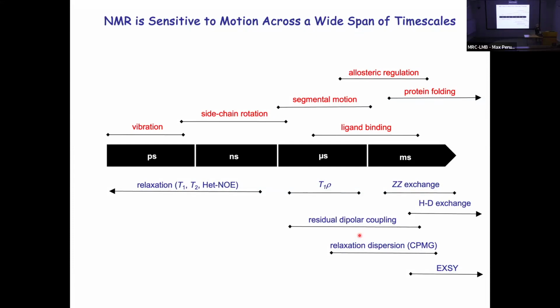talk in more detail about some of the examples that you get in real case studies from LMB's portfolio. This is a slide I've nicked from Jane, and it's just illustrating the sort of approaches that we can apply to NMR experiments that will reveal detailed pictures of the dynamic processes going on inside the molecule. And these are the sorts of motions that we're aiming to pick up in the behavior of the molecule. Jane will go into more detail about this next week, but NMR has this handle on dynamic processes of different timescales.